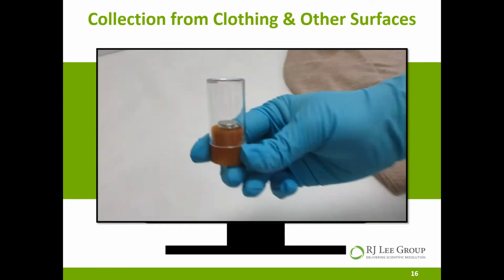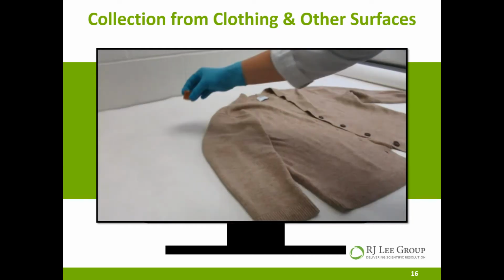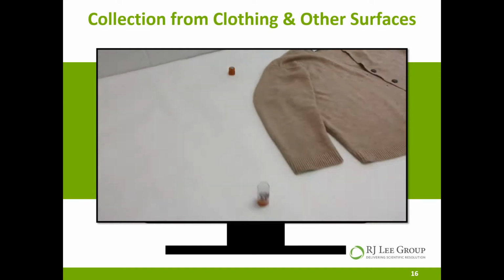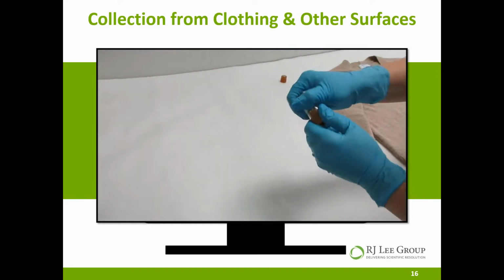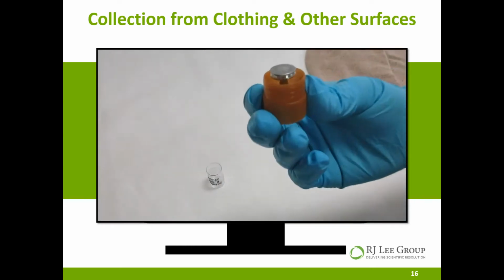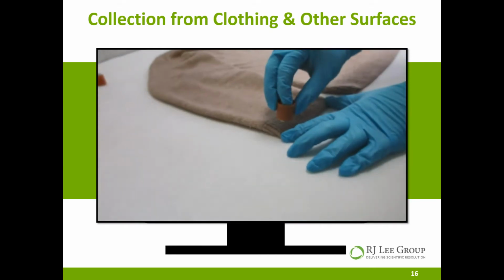Right now, I'm also getting a blank stub that I'm going to use as what we refer to as our PE control, or our particle extraction control. So it's going to sit out open in the room while I am particle extracting. And then I just go ahead and wiggle the lid off of that sample, and I'll get to work.